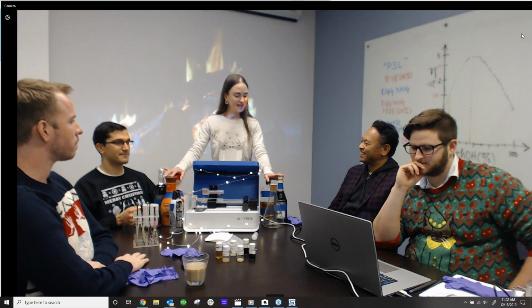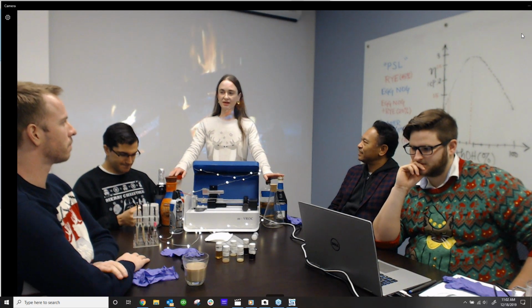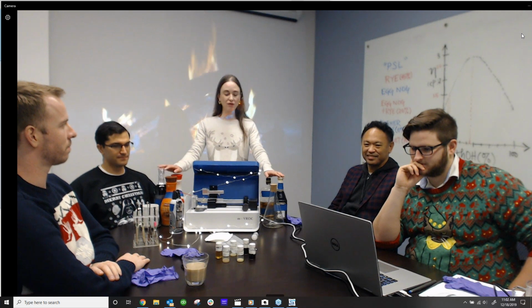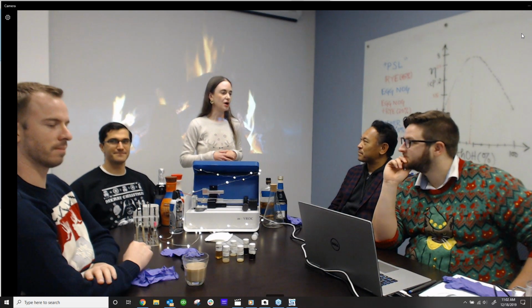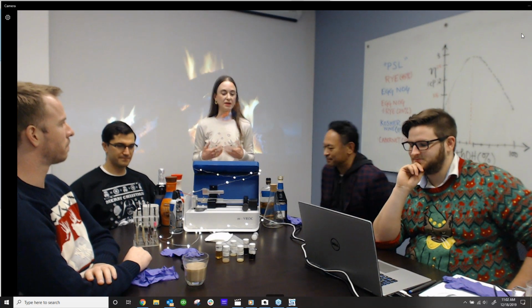One way to test your beverages to check for alcohol content is viscosity. Viscosity is very sensitive to the contents of ethanol. So we have a variety of beverages here today that our engineers, who have agreed to join in and help, are going to test for us, and then we're going to talk a little bit about the data and how you can make some sense of it.